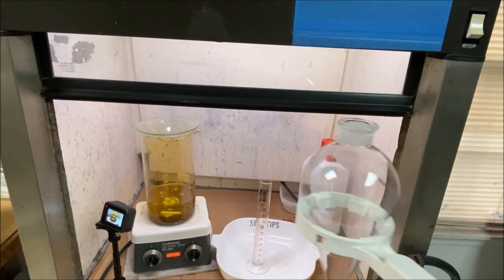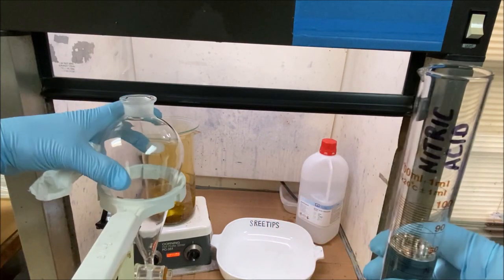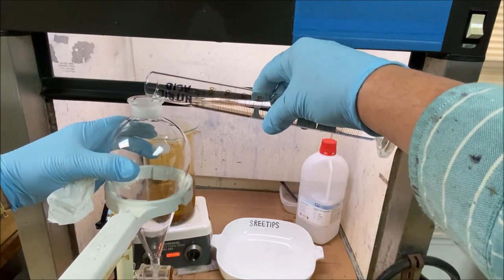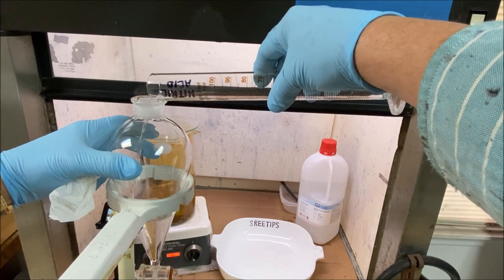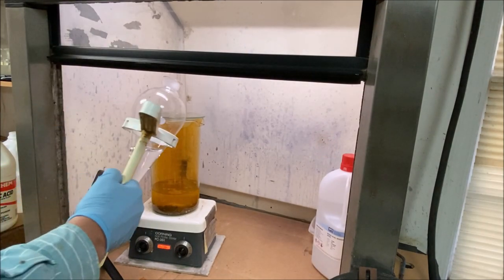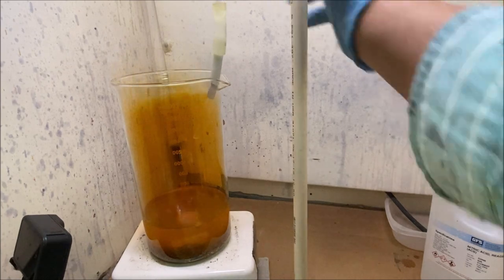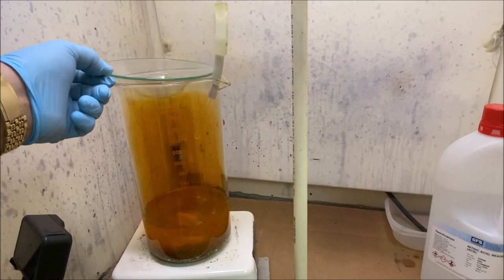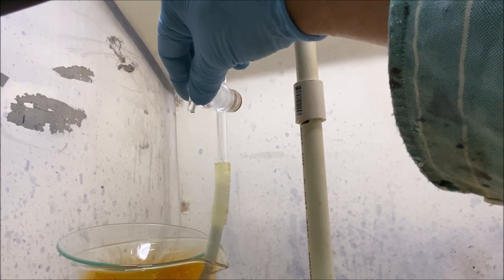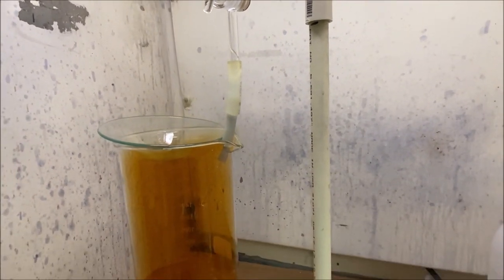Now I've got my nitric addition apparatus here. I'm going to add the rest of the nitric to this addition funnel. Make sure the valve is off and just pour the nitric acid right on in. Now I'm going to slip the nitric addition funnel into the fume hood carefully. I'm going to turn the acid drip on and drip nitric acid into the reaction slowly so we can dissolve this gold at a nice steady pace.